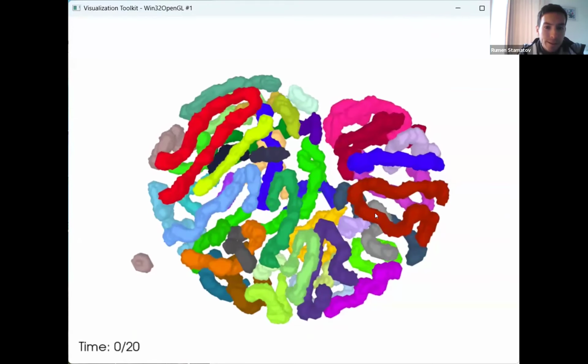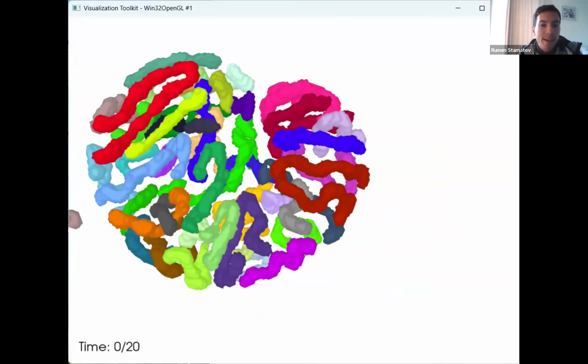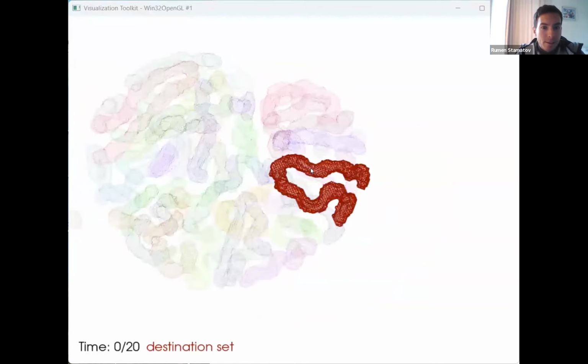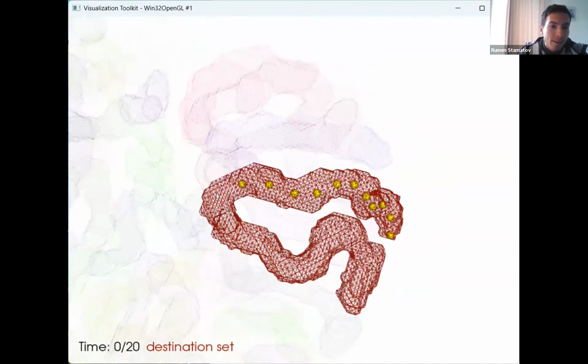Another useful thing that I can do is, especially in this case, when we have not a circular object like a cell, but something that's more like elongated, I can draw a center line. So here, let's say I'm interested in this chromosome, so I can place points semi-automatically, and then the program is going to use these points to fit a spline curve in 3D, like that.